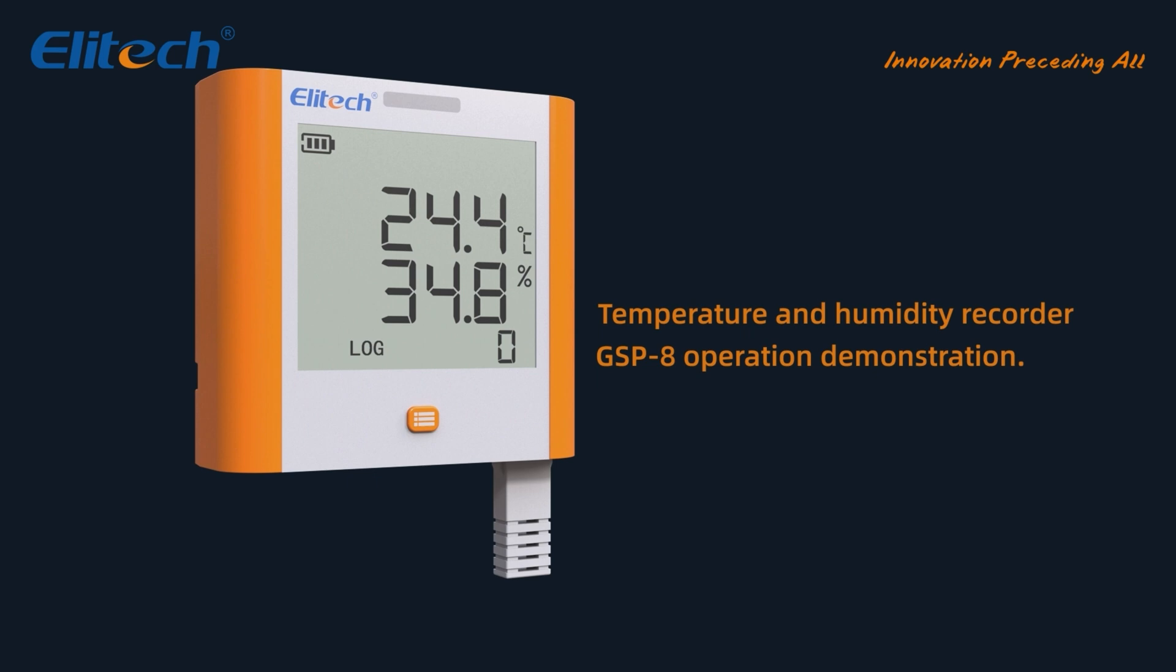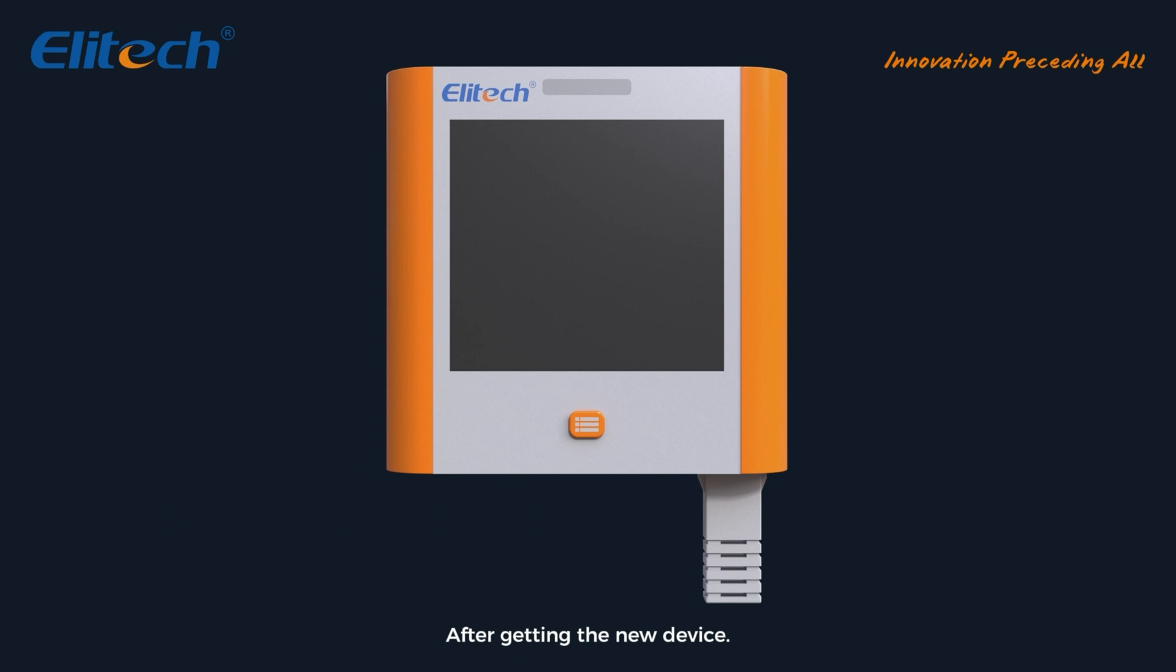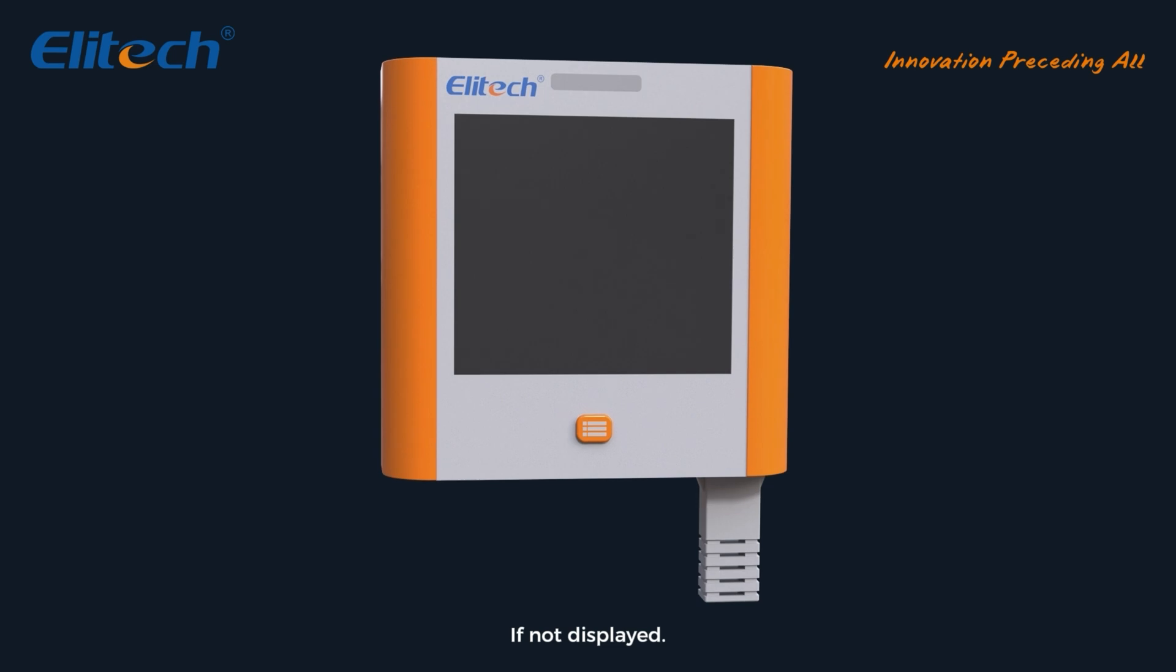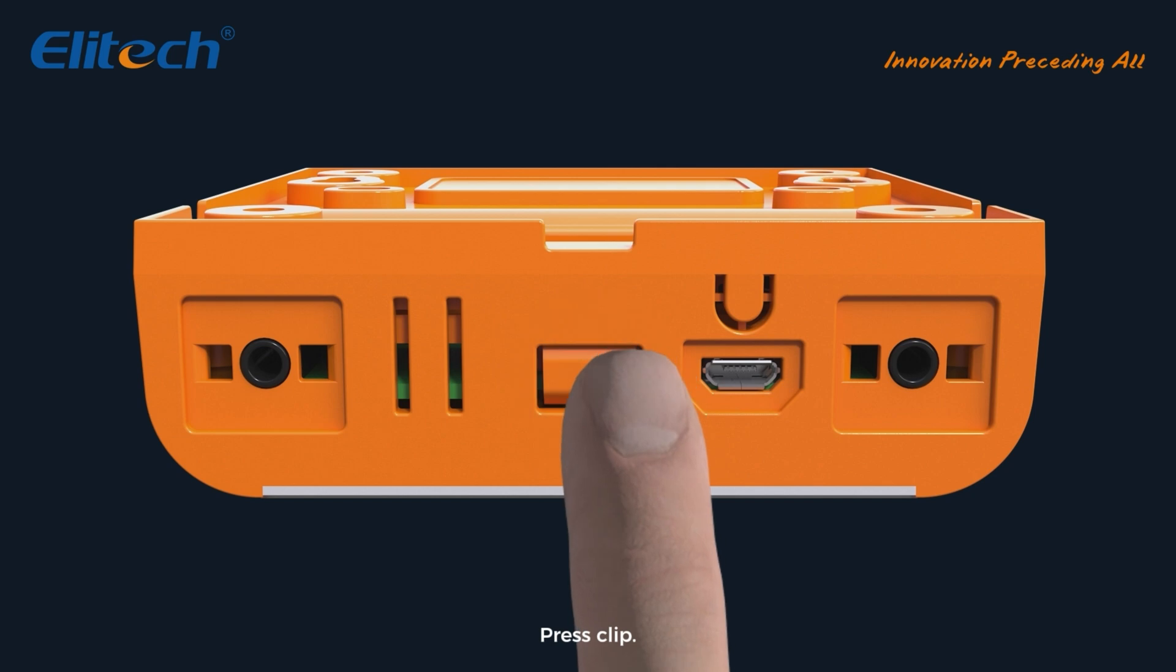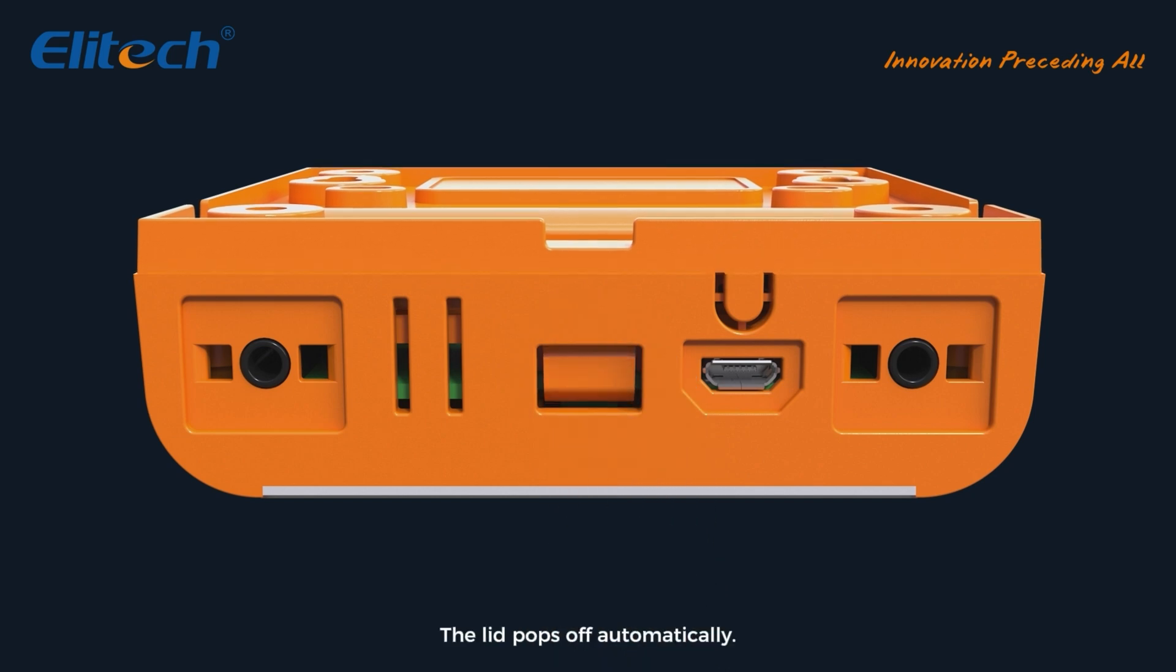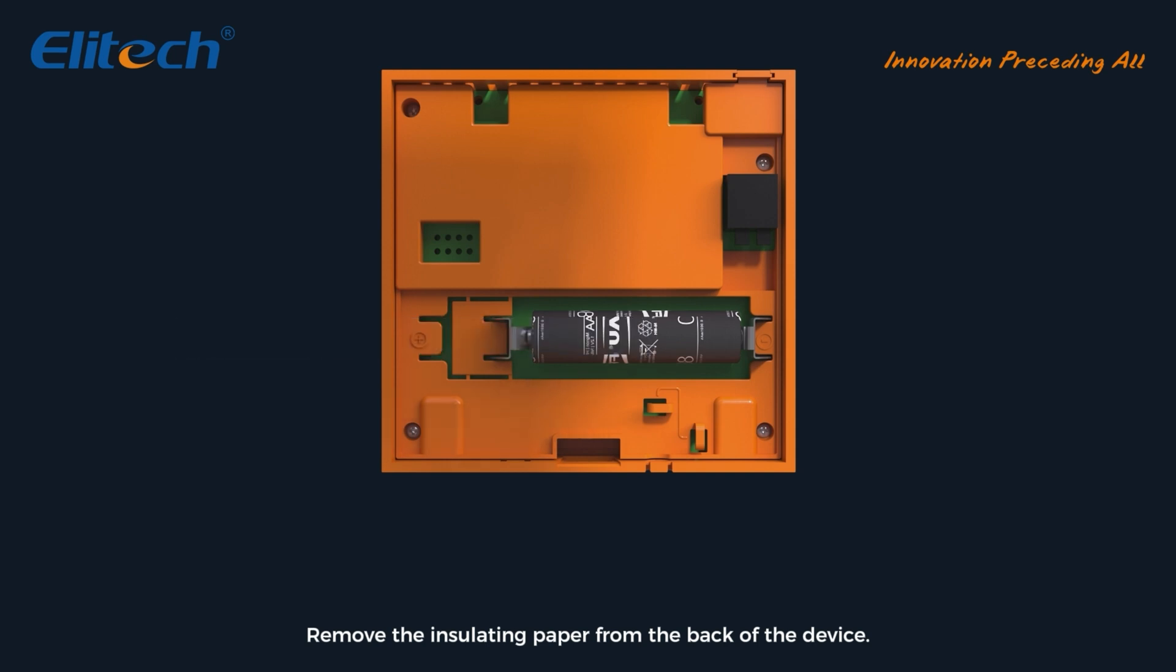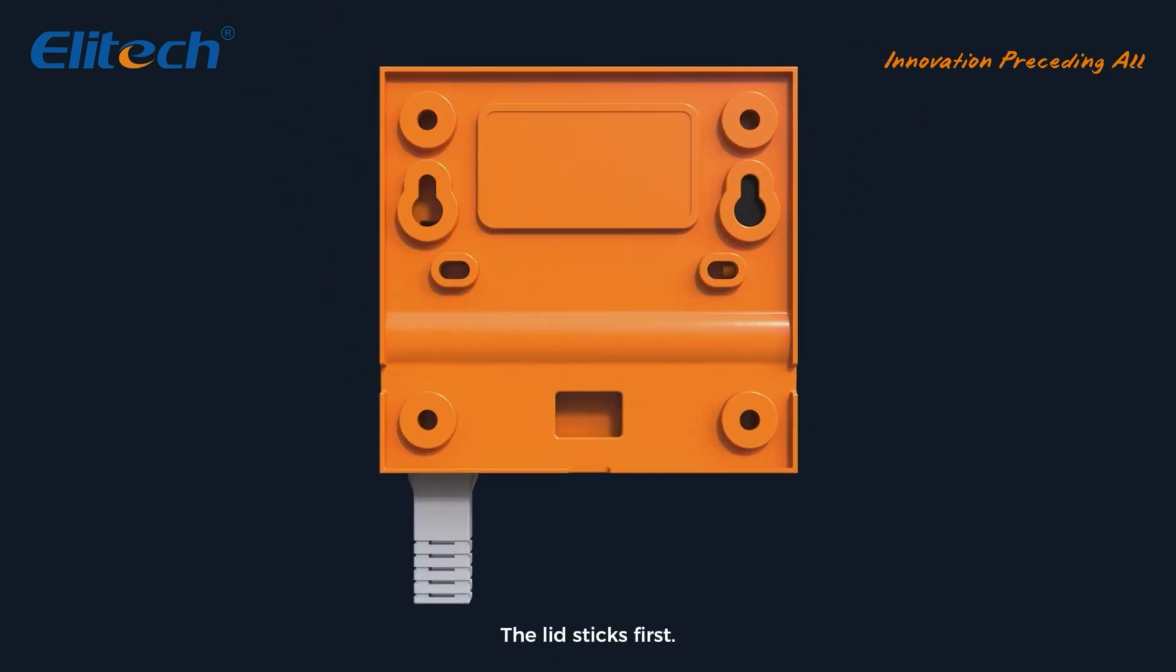Temperature and humidity recorder GSP-8 operation demonstration. After getting the new device, press to see if the screen is displayed. If not displayed, turn over the equipment. You can see the buckle under the device. Press the clip, the lid pops off automatically. Open the lid and remove the insulating paper from the back of the device.